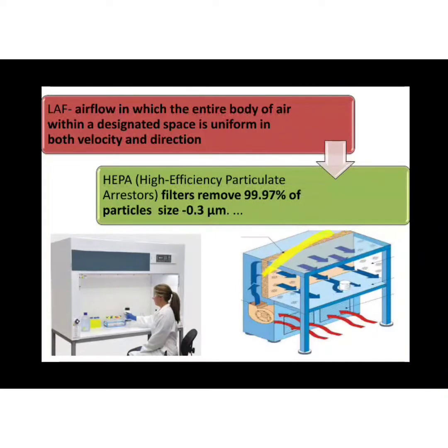This is the filter. It will push through the filter and only the sterile air will be pushed out of the filter, and this is a working platform and this will be filled with sterile air, and this is a continuous process until I switch off the burner. Now, what is the efficiency of these HEPA filters? It can remove around 99.97%, so the air that is coming out is 99.97% sterile.